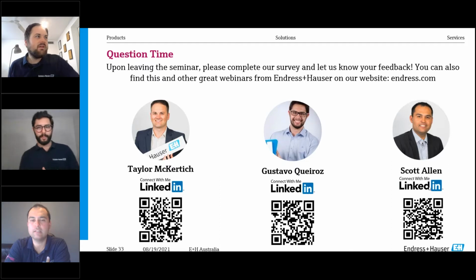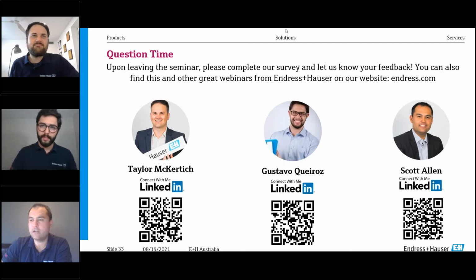That's a good one. We've got a question from Brendan. He asks, can the heartbeat technology be used with analog sensors or just with MemoSense sensors, the digital ones? Scott? It's a good question, Brendan. Heartbeat is only suited, from a liquid analysis perspective, for the MemoSense sensors. It goes back to Gustavo's first couple of slides, where we convert the analog signal into digital, and it's really about getting that digital data. So unfortunately, it's only for the MemoSense offering and not analog sensors. All right, thank you.